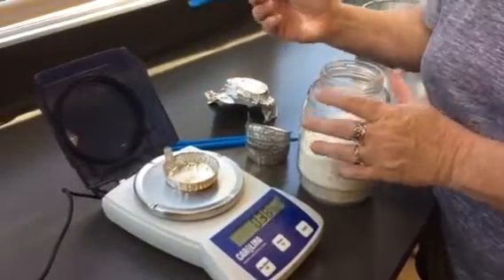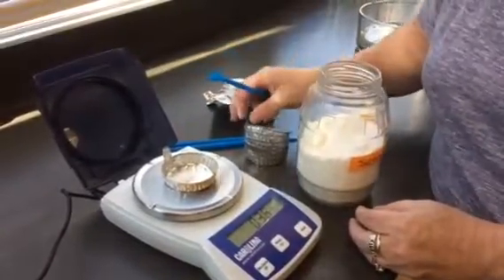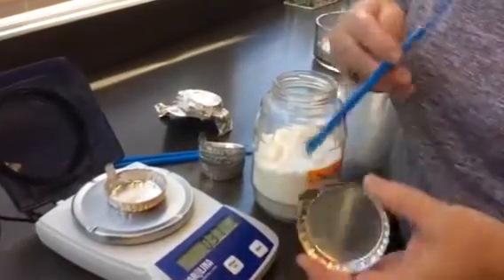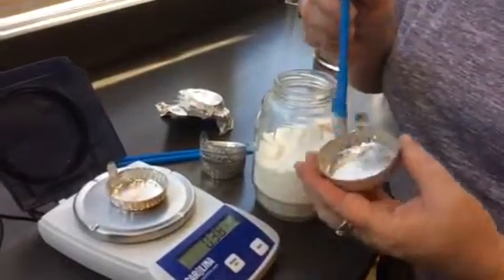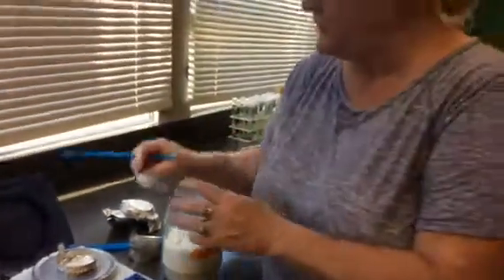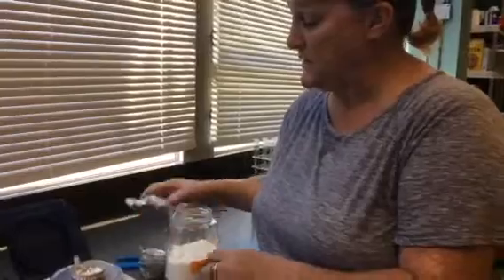Make sure that you zero the scale every time, and make sure that you use a weigh boat that's been tapped out. If any water gets into the weigh boats, then you have to clean them and dry them, because otherwise it'll stick and it'll affect your measurements, and that will affect the outcomes of your experiment.